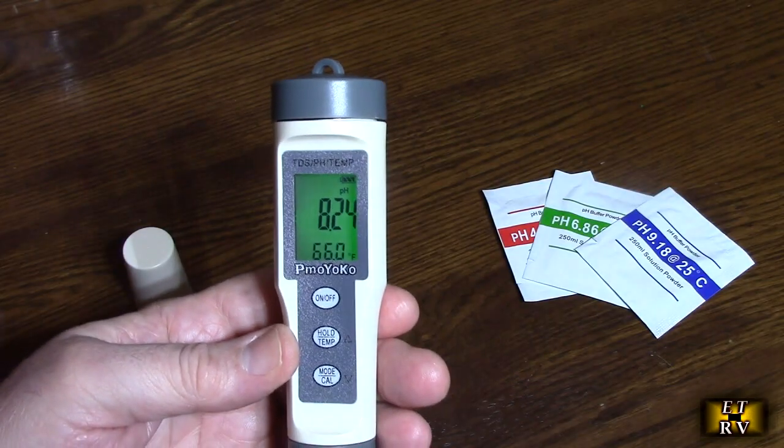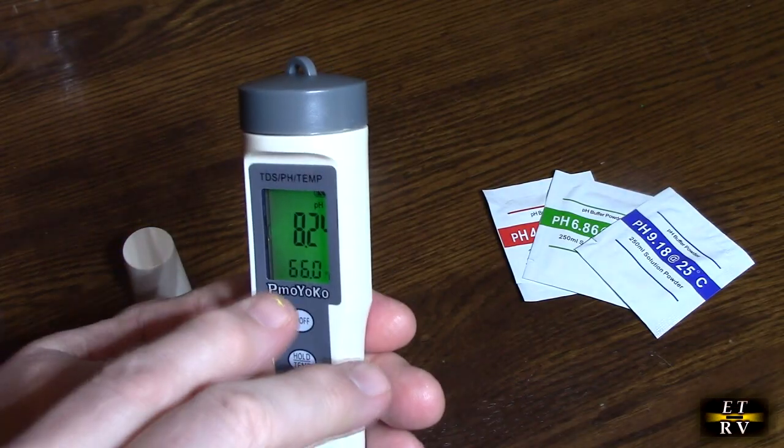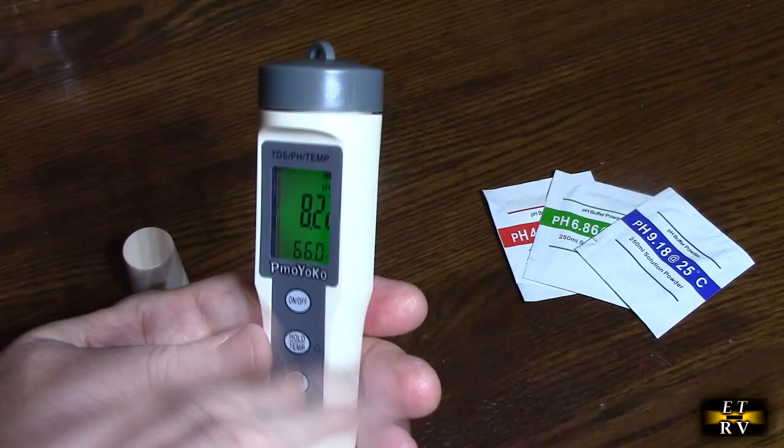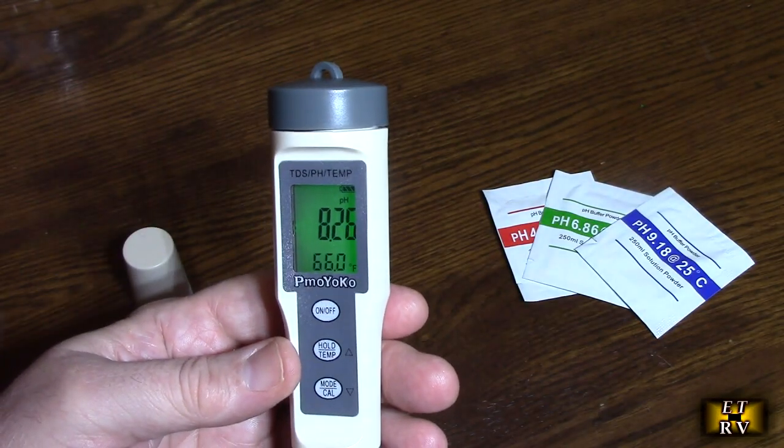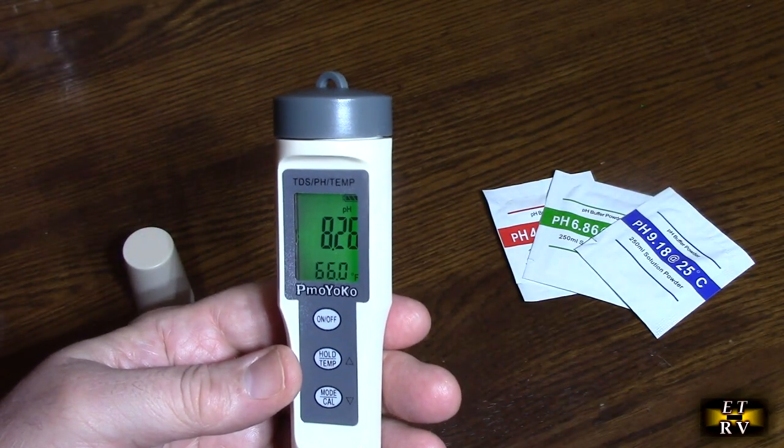So this is unique because it has temperature as I showed, pH, and parts per million which is a unique combination. So I'm impressed with the product.